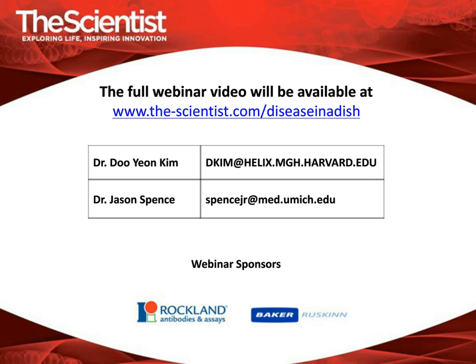Yeah, I think that's a really great question that applies not just to the organoids, but to any experimental design and experimental result. For us, the way that we design the experiments is that we try to reduce individual variability from individual organoids for each experiment by pooling organoids together for our analysis, and also by running many biological replicates. And so we often will run at least 3, but more usually on the order of 6 independent biological replicates.